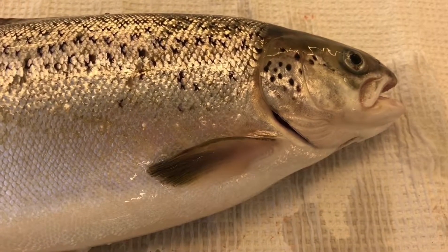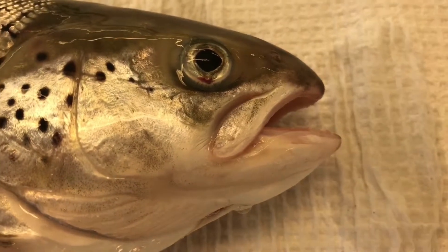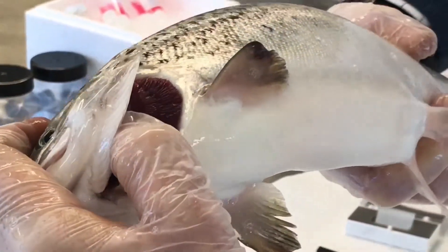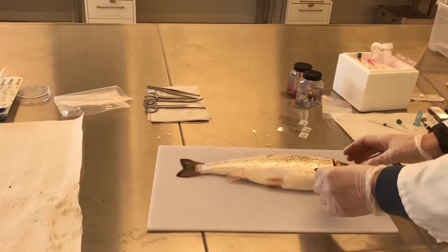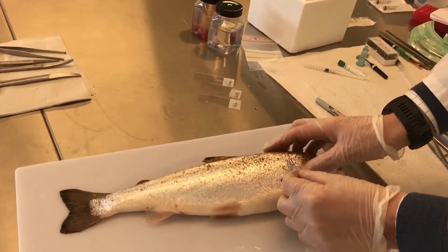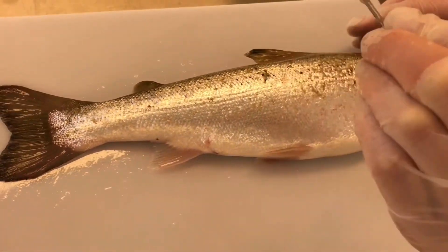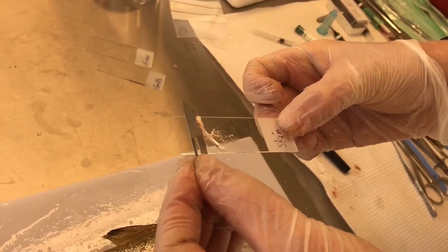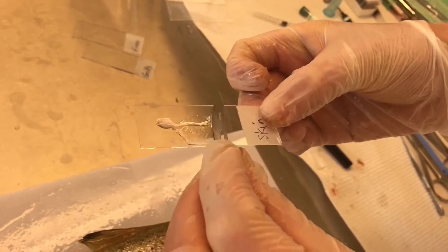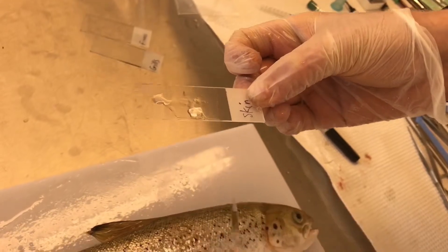Now we are going to take mucus from the skin, the fins and the gills. From the skin, just a very gentle sliding of the coverslip on the surface of the skin, and put it over the object glass that has been marked 'skin' in advance.